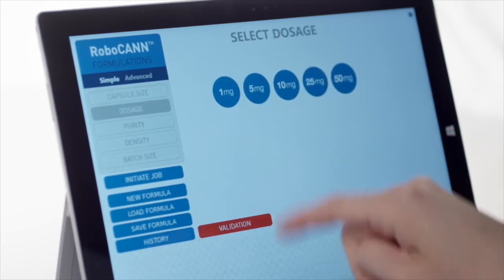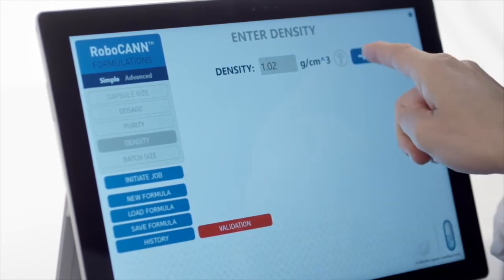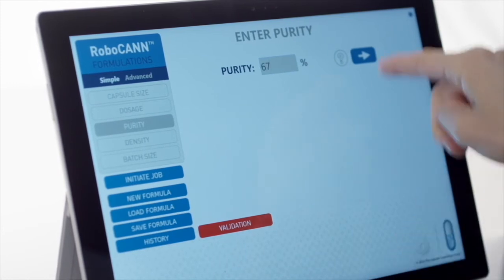The Robo LQ accounts for all formulation factors, including product density and purity, reducing error while also saving time.